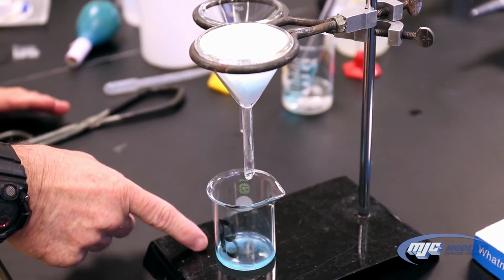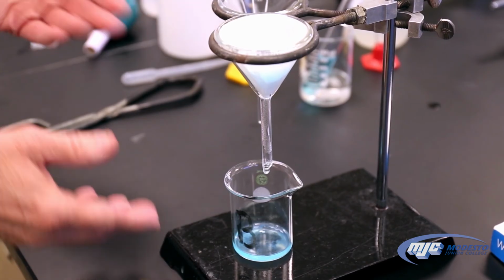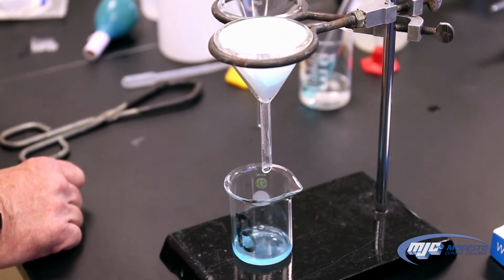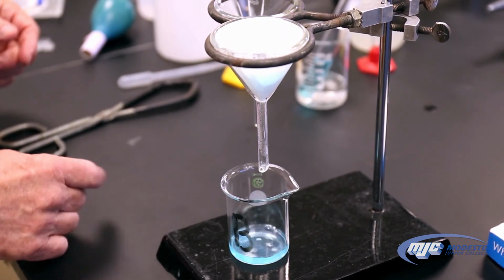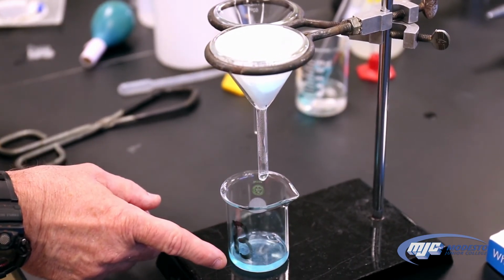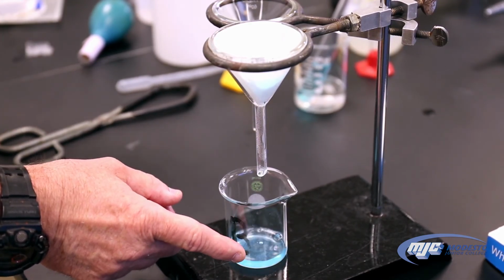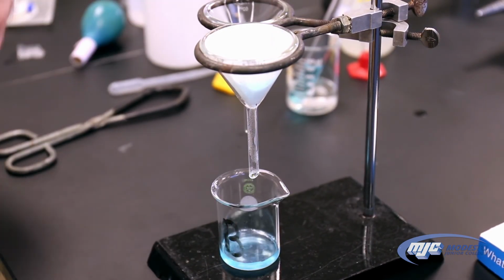You'll notice that there's a blue color in the filtrate, the stuff that's coming through. That's because there's still copper 2 ion in there. The precipitate on top, which is lead 2 sulfate, will be white. Once it finishes filtering, we need to wash it, and we need to make sure that we got all of the lead out of the solution. So we're going to add just 2 milliliters of sodium sulfate to the filtrate, the bottom beaker. If we see a white precipitate forming, that means we didn't get all the lead out, so we have to add that to the top of our precipitate.